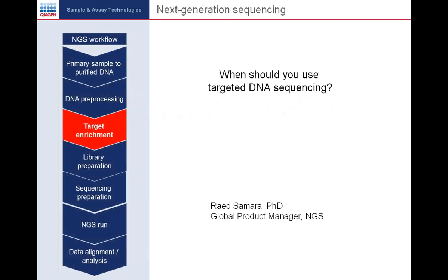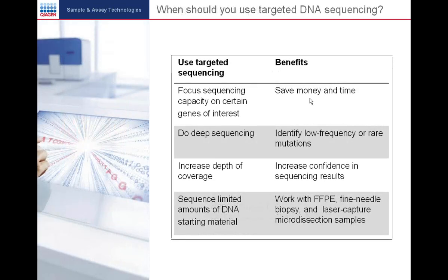Today's question is, when should you use targeted DNA sequencing? Let's ask Rayed Samara, Global Product Manager for Next Generation Sequencing Technologies at QIAGEN. Rayed? Thank you, Ali. Targeted DNA sequencing should be used when one wants to achieve any of the following. First, focus sequencing capacity on certain genes of interest, which saves time and money.